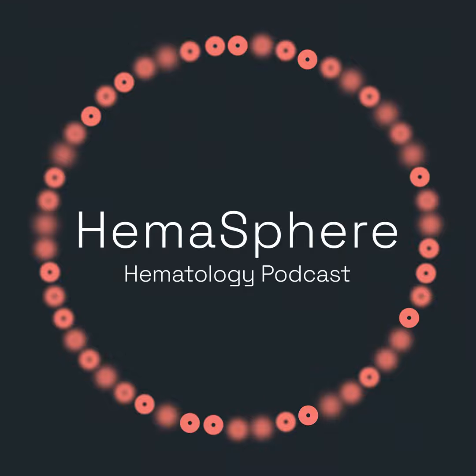And you do see in the field that in the last couple of years, there's an increasing attention for the topic. I think it makes a lot of sense if you look at the type of flow cytometry data that will be generated in the near future. It's almost impossible to do this type of analysis without any sort of computational method behind it. So I think that largely explains why there's increasingly more attention going towards this topic.